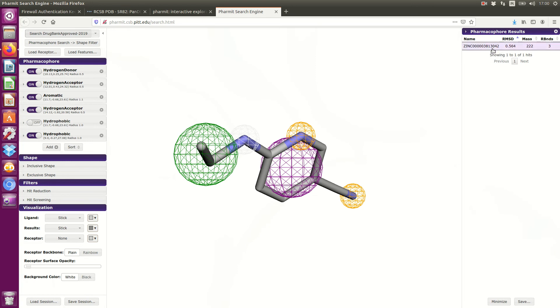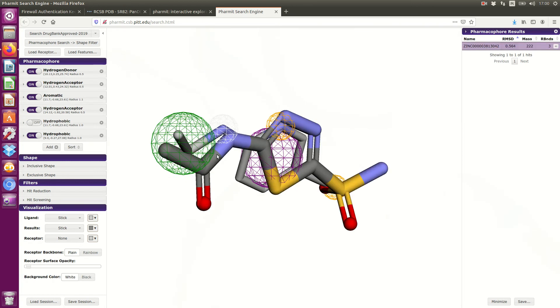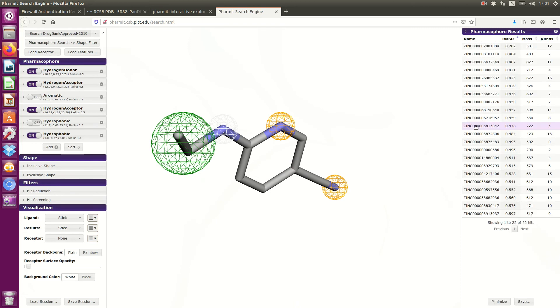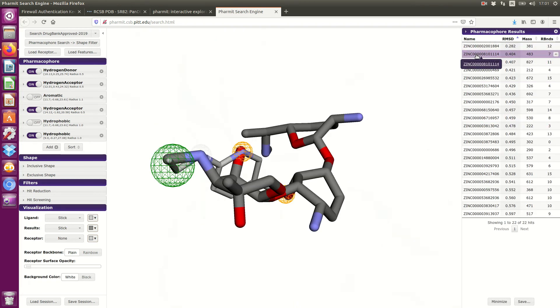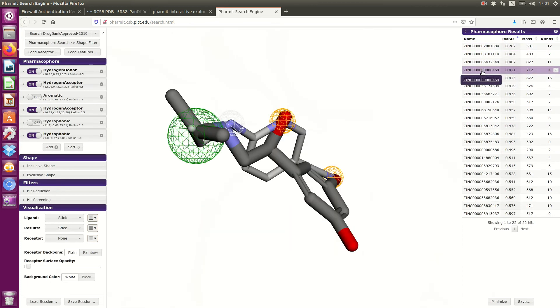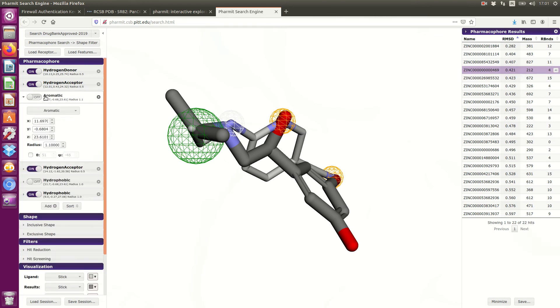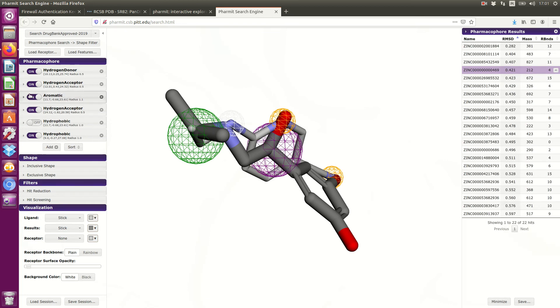Now I got one result. As you can see, it fits very well with the crystallographic ligand. I will make the search again, removing one of the pharmacophoric features, and make a new search. As you can see, I can now find several compounds. You have to test several other options and try again.